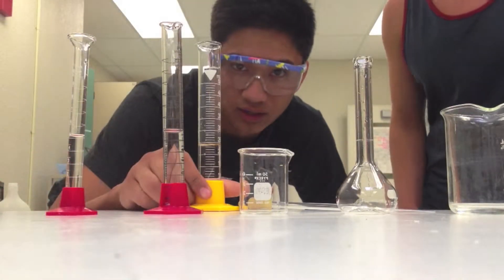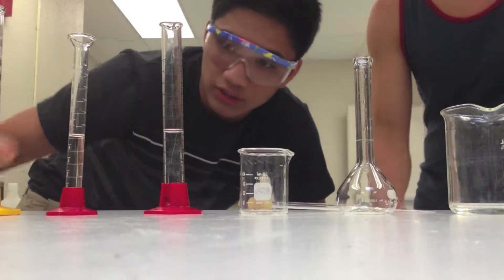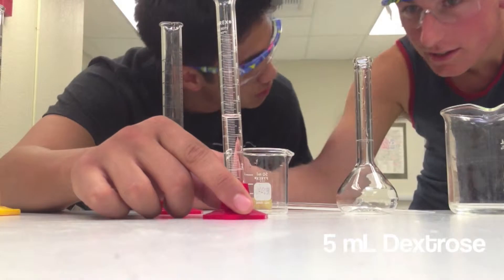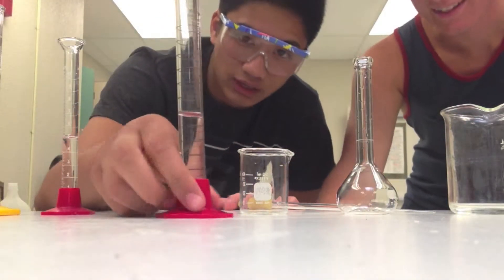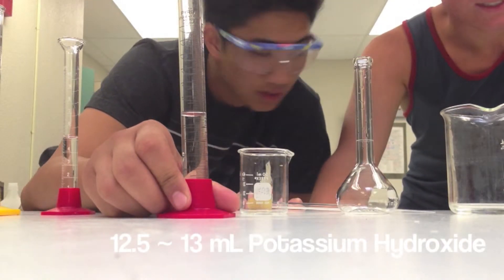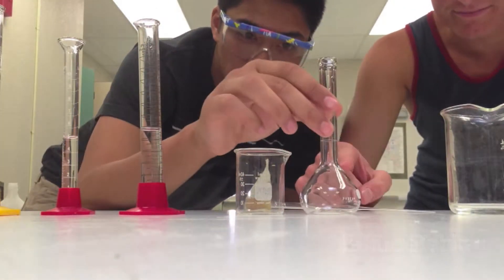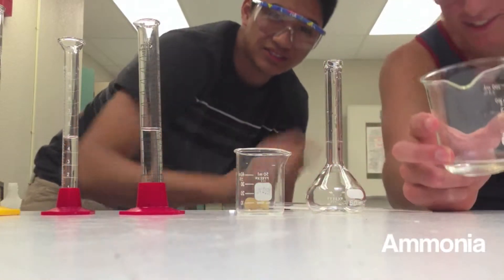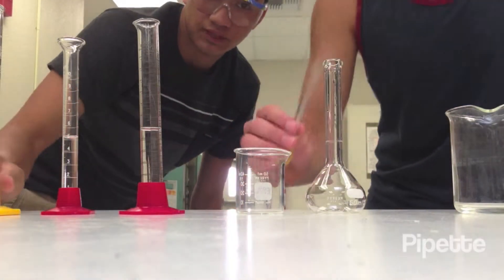So we got silver nitrate — 25 milliliters of silver nitrate, 5 milliliters of dextrose. What's dextrose? Sugar. Glucose. We all love it. We got about 12.5 to 13 milliliters of potassium hydroxide, a 50 milliliter beaker, this cool little tube thing, ammonia — it smells great — and a pipette.